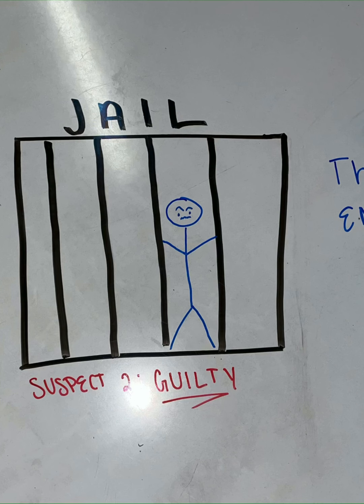After looking at the bands of all suspects and comparing to the sample left at the scene, we can conclude that it was suspect 2 that left the hair since both loci showed a 100% match. Suspect 2 is guilty of murder.